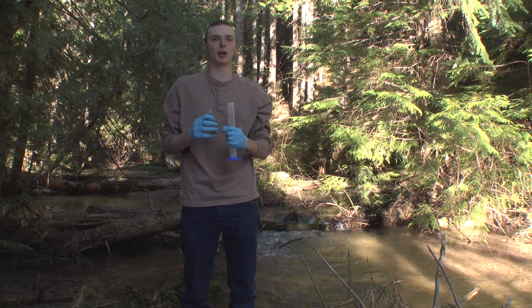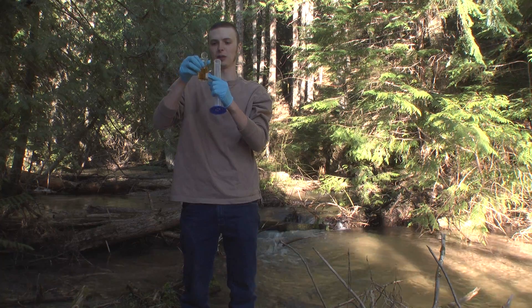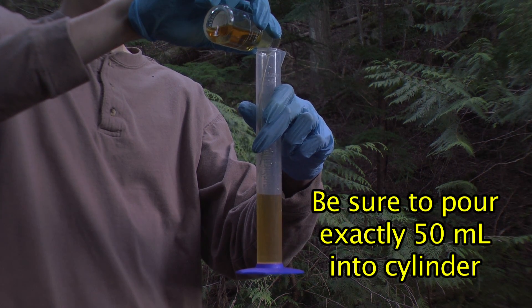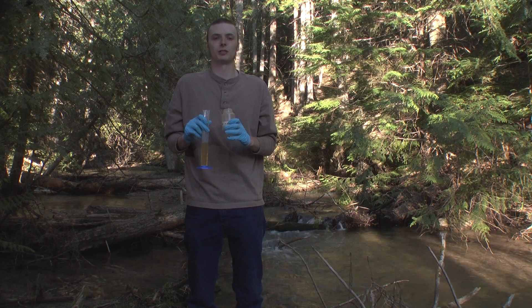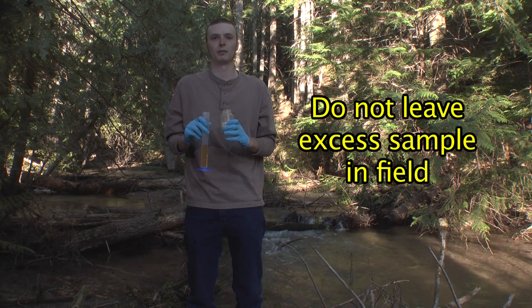Once you have added your dissolved oxygen number three pillow packet to your sample and you have a brownish hue like this, you will pour off exactly 50 milliliters into a graduated cylinder. It's important to pour off exactly 50 milliliters — if you pour off an extra 5 milliliters, this can greatly affect your sample. Your excess sample is toxic, and it's important that you take it back to the lab with you. You cannot leave it in the field.